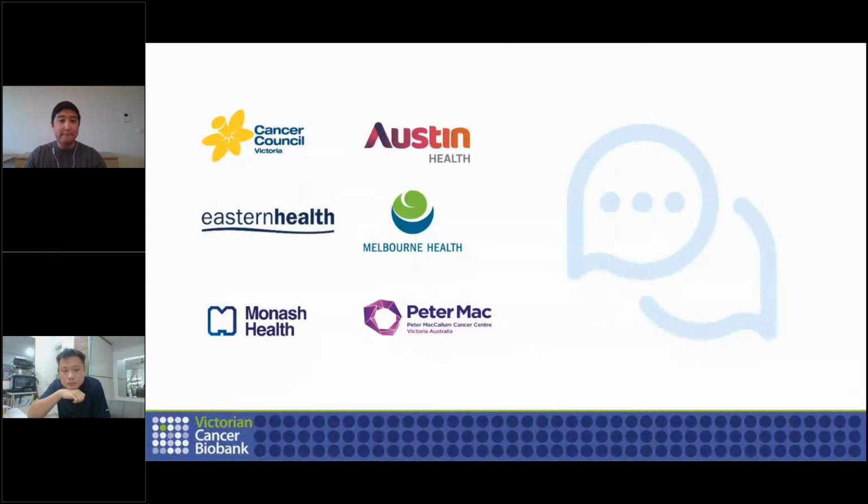Okay, thanks. And you capture data like time of collection, time of receipt, time of biobanking, all those time spots, so that you can do some turnaround time analytics on that. We do. While we capture it, we don't use it at that granular level, but we do compare month to month, and that sort of thing.